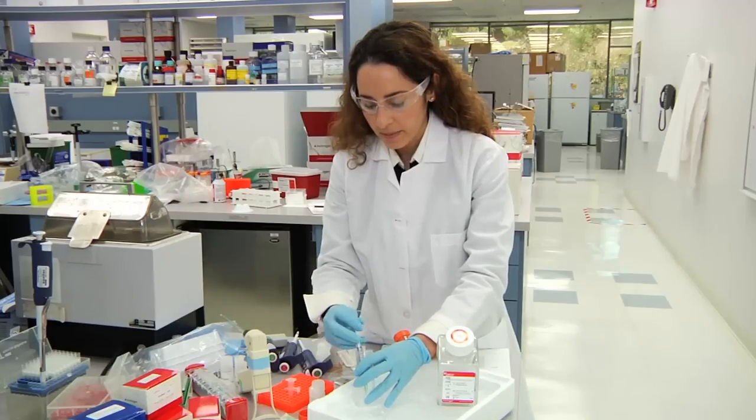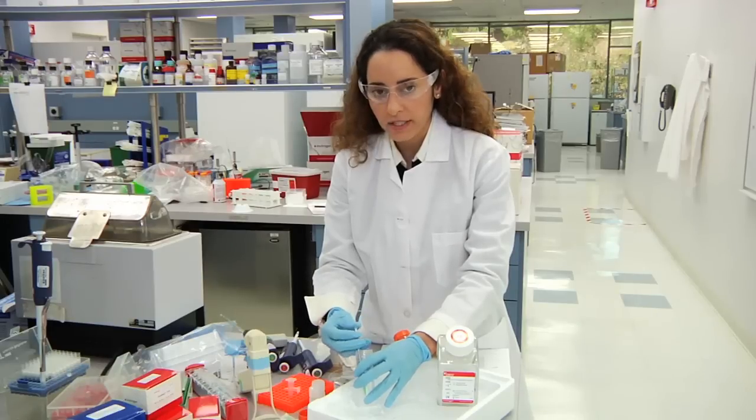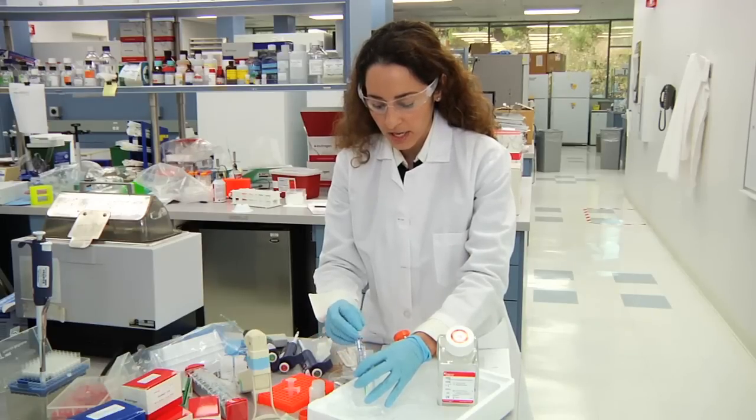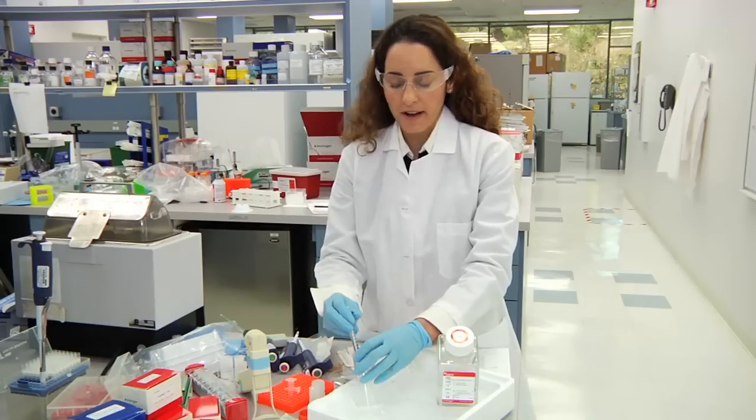Keep the sample on ice as you're doing this. Once you've reached 20 times, the sample has been fully homogenized and you can move on to formaldehyde crosslinking, which is step 5.